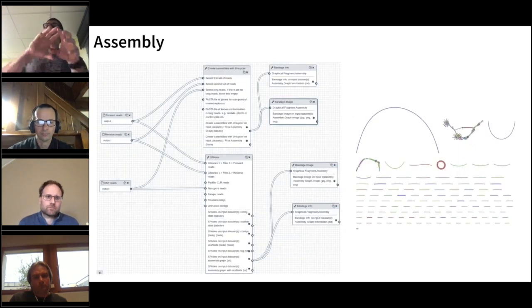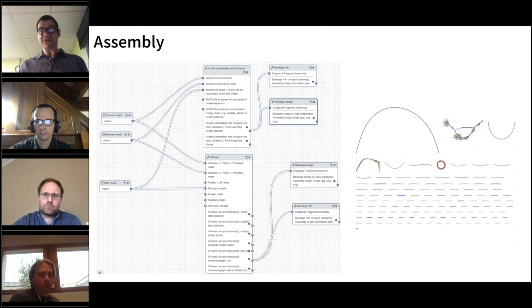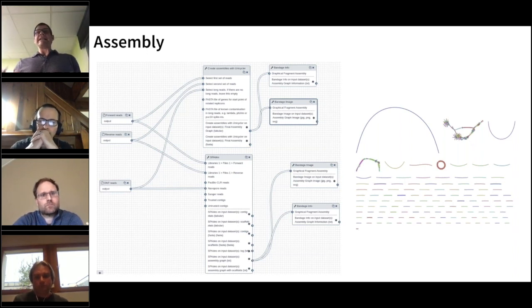There are several kinds of them. I'm just going to highlight two. One of them is assembly. Assembly of SARS-CoV-2 is not particularly complicated if you have good data. It's a single short transcript. The complication there is that the data is usually metatranscriptomic in nature, because you sequence, for example, the content of the fluid from the lungs.